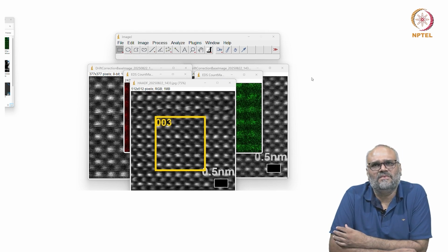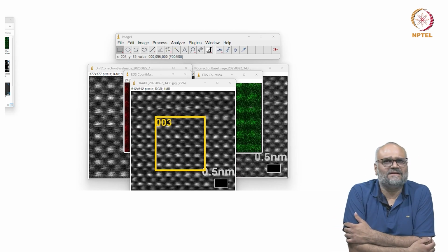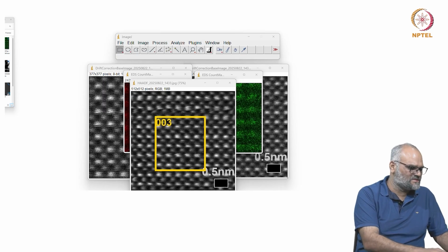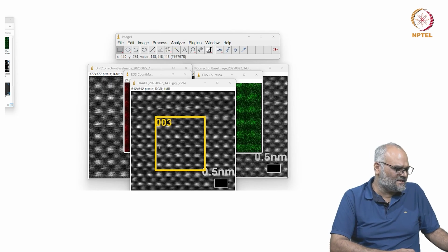Now, you can actually directly put one next to the other. And one common way of presenting these images would be like this. So I usually use PowerPoint to make images, and it is a simple, readily available tool.